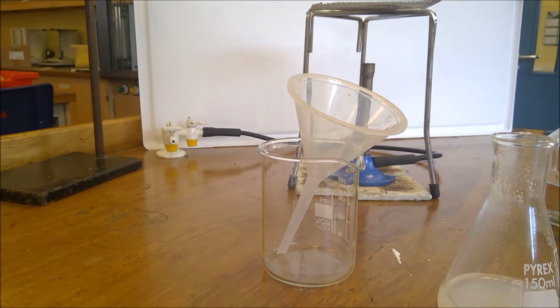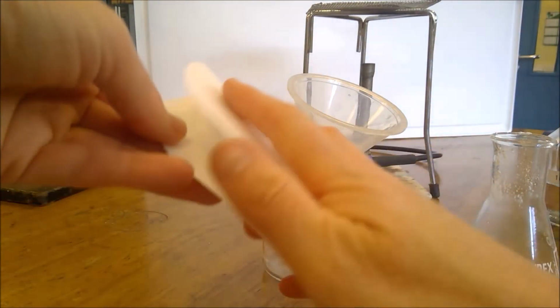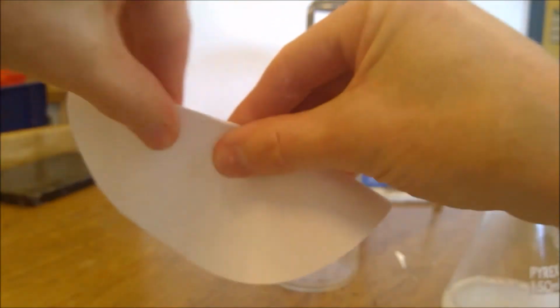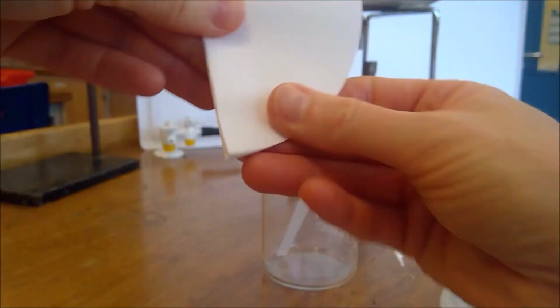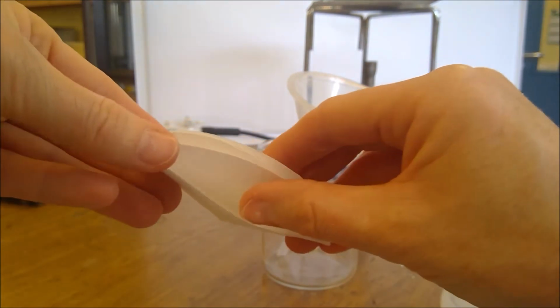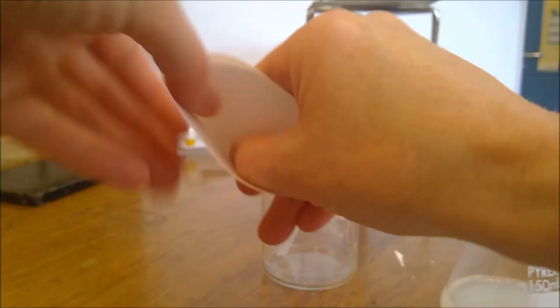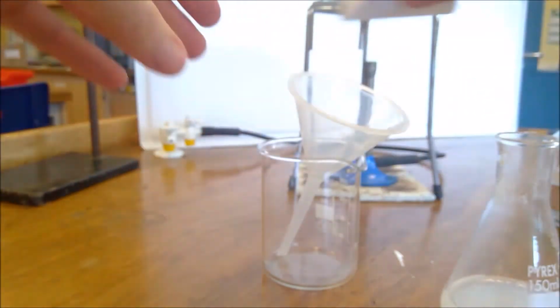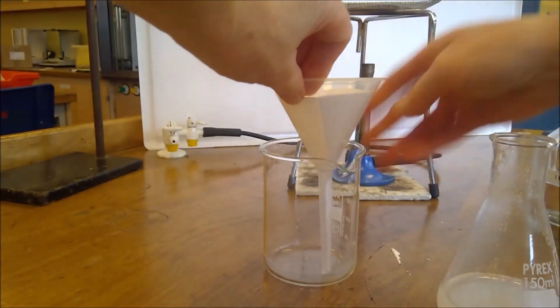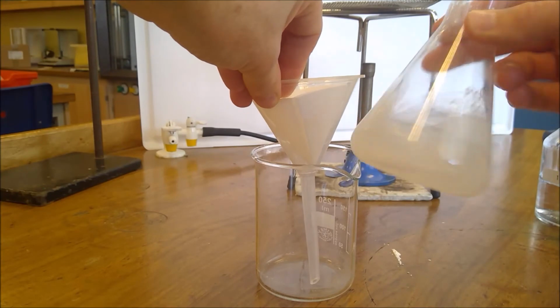So here now we have our funnel and a beaker to collect our filtrate. So we take our filter paper, we fold it in half again, and then we take 3 sections on one side. Can we see 3 sections there? 1 section on the other, and then make that into a cone, and then that is going to go into my funnel, and then we can filter the mixture.